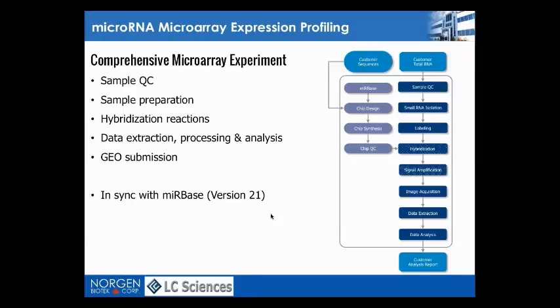Besides that, of course, you have a dynamic range and sensitivity that's somewhat tunable in next-gen sequencing. And you can also detect structural variations like single point mutations, gene fusions, alternative splicing events, and so on. And of course, it's a truly digital solution, meaning it's a quantitative method.